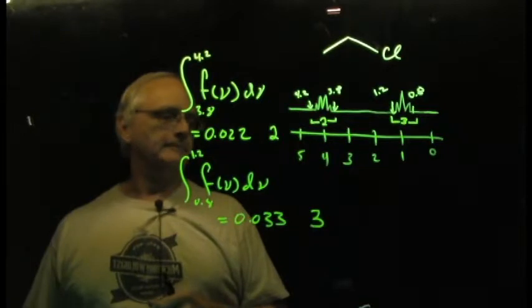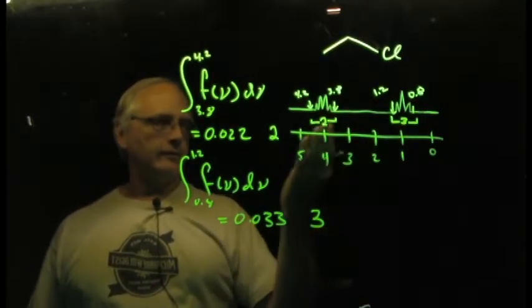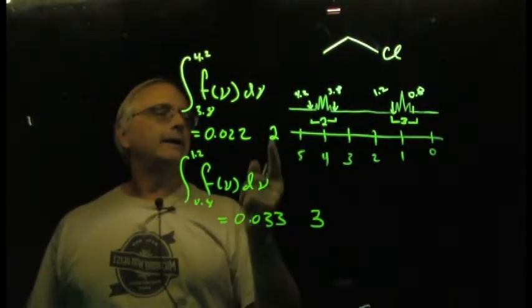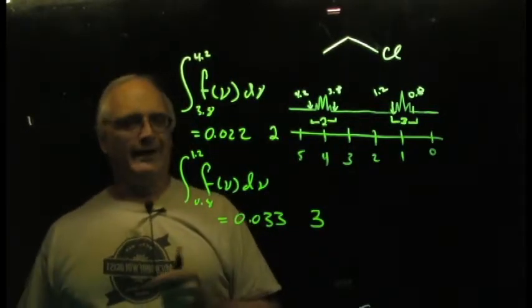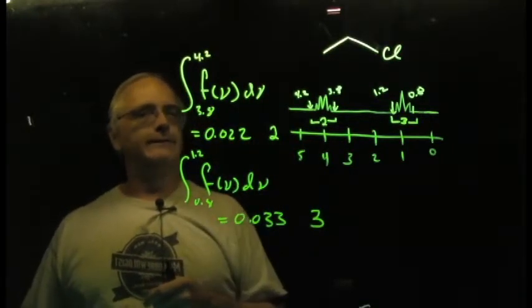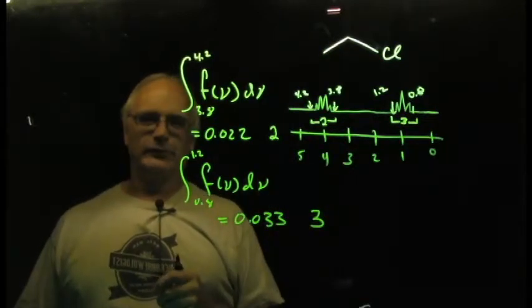Pretty straightforward. Now, in reality, when you see these 3 and 2, yeah, those are idealized numbers. In reality, if I tell the computer, call this one 3, it will come back, and it will probably come back with 1.98, 2.02, or something. So in our heads, yes, we do round to the nearest whole number, and it's usually pretty simple to do.